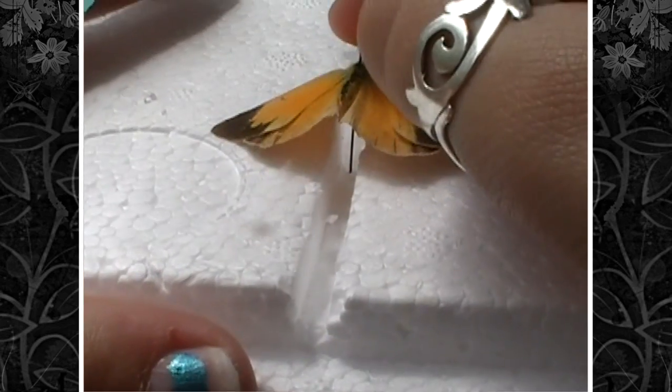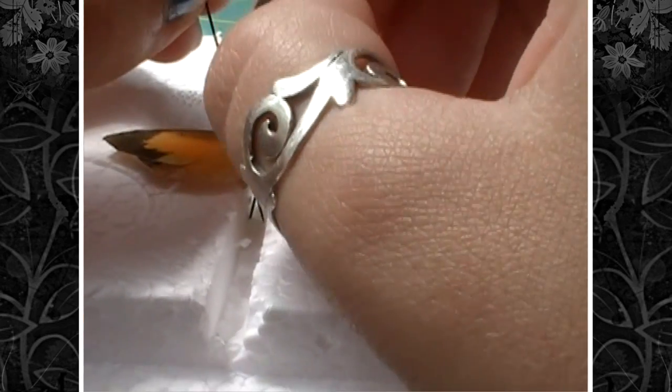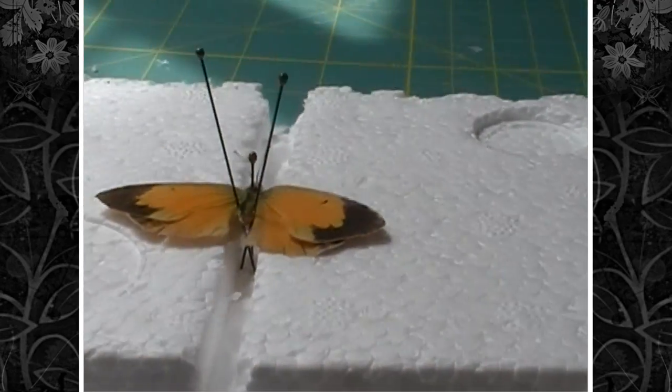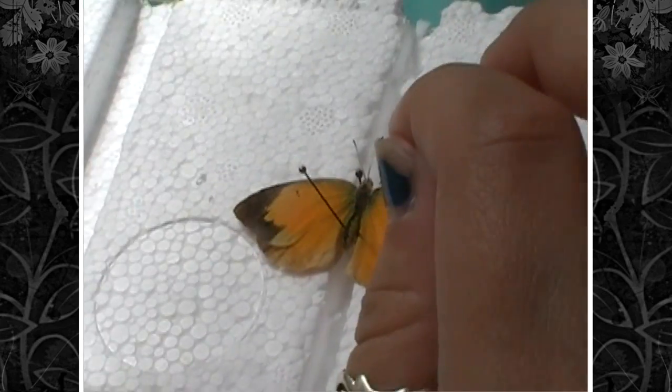Then you're going to put him in the slit in your spreading board that seems to best fit, and hold his abdomen up with a couple of pins. This is so while you're trying to spread him, he won't spin around on the pin.